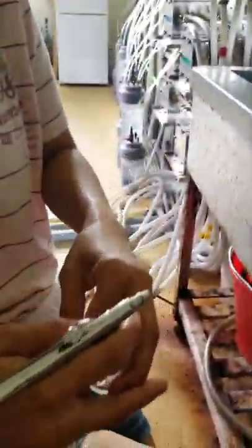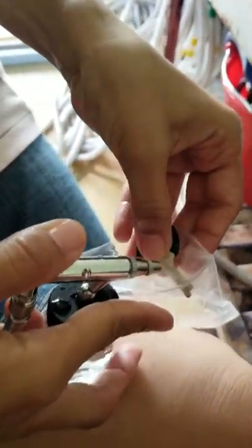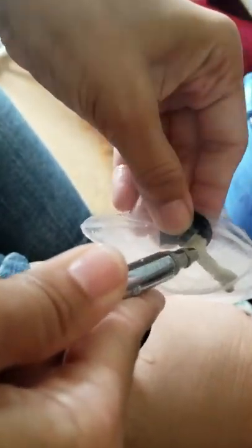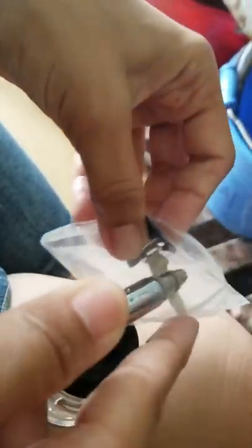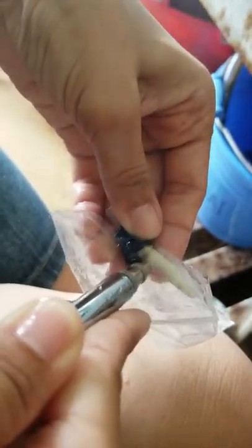We continue to remove the coral tissue again until all of the coral surface area is bleached. Look at this one — it's completely white now, it's very white.